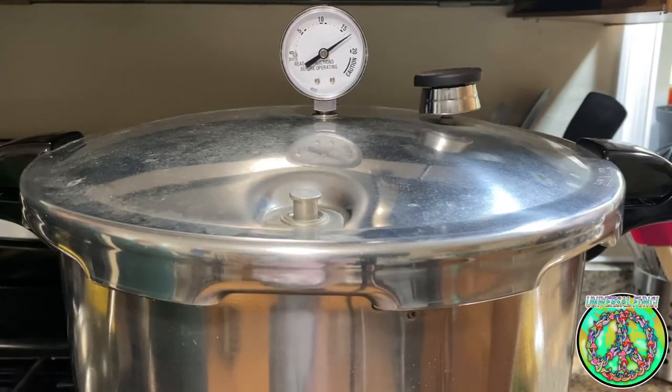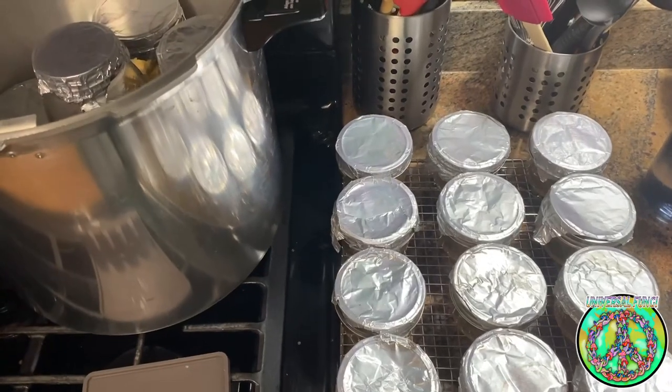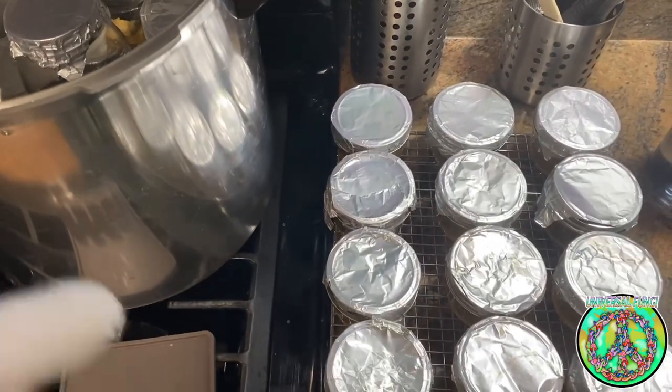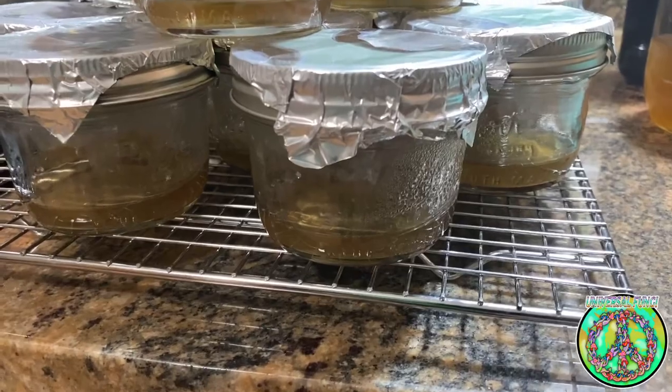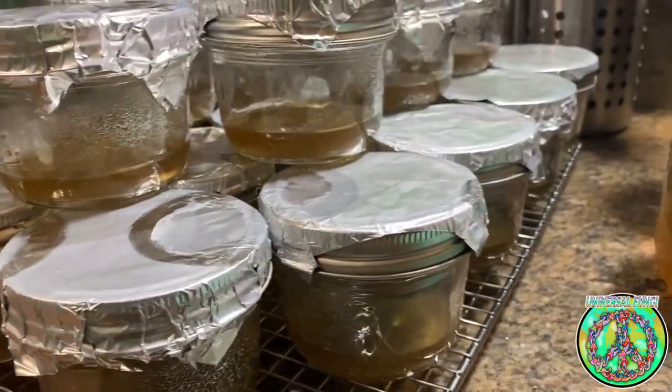After 30 minutes, I let the pressure cooker cool down on its own and then I removed the jars allowing them to cool further. Once the agar has fully solidified, it is ready to be used. Much Love!